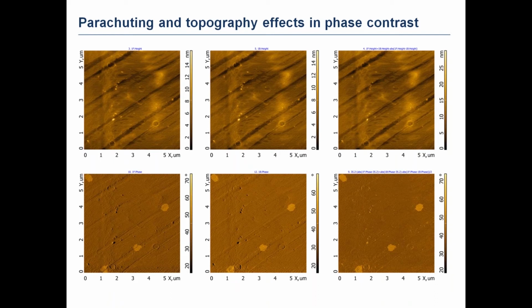So these features, like the parachuting effect, should be taken into account while adjusting the scanning parameters in tapping mode.